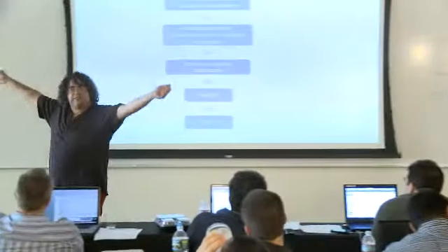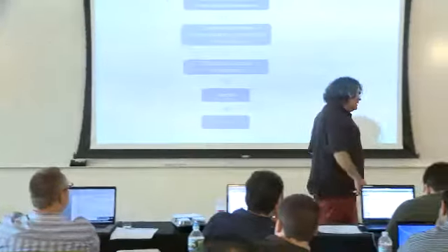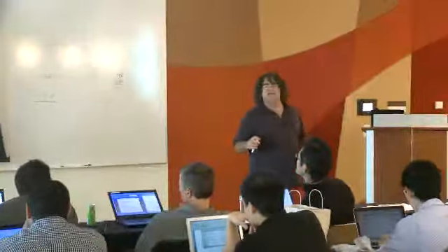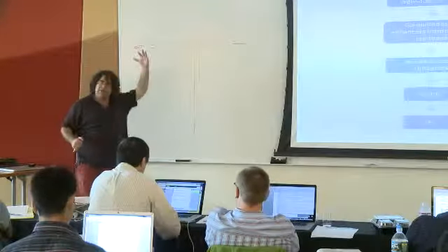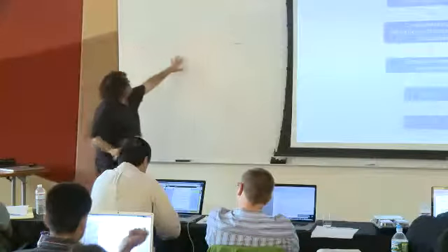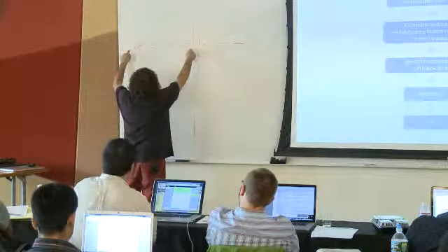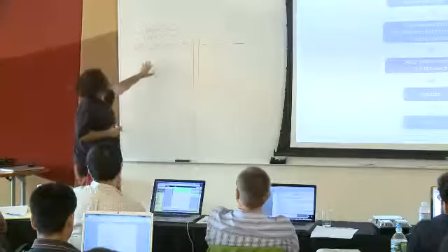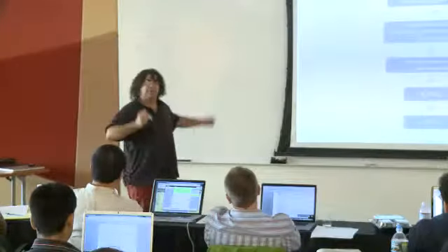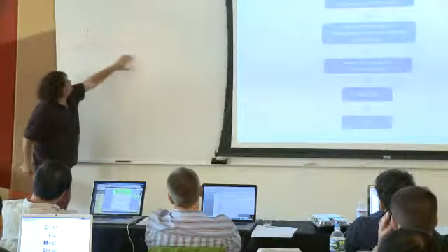Now, if you take some set of sequences, especially larger ones, let's say all the enhancers, and you ask, statistically speaking, do I find any 6-letter or 8-letter sequence overrepresented or surprisingly represented? The answer is no. If you have noise, you will not be able to find it. But once you trim it down to a set of enhancers that seem to have a common profile of activity across cell types, and you ask, among all these sequences, does something come up? You can run a program that scans all these thousands of sequences and tells you, yes, in this set, A, G, G, C, T, A, G and A, C, A, C, and so on, these two statistically significantly appear more in this set than in a null model where you just look at random sequences. And that makes you think, okay, something may be using these sequences to turn these enhancers on.